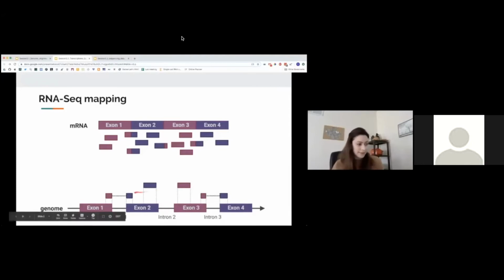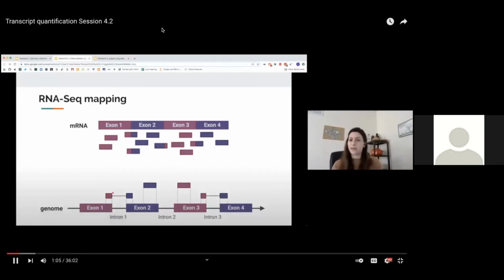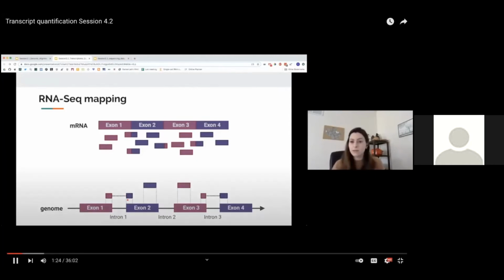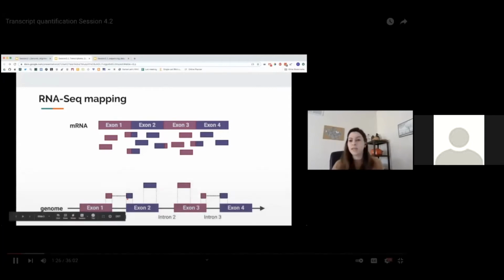And then you can understand how for a mapping algorithm, it is hard if you have a read that is split, and 20 bases of it are in this exon, and the remaining 30 bases are 100 kilobases farther away. The way these algorithms deal with it, if they are splicing aware, is not the same as having a short gap.